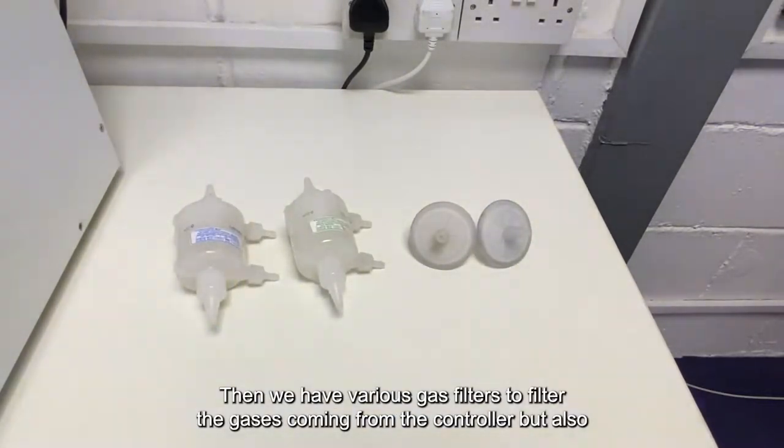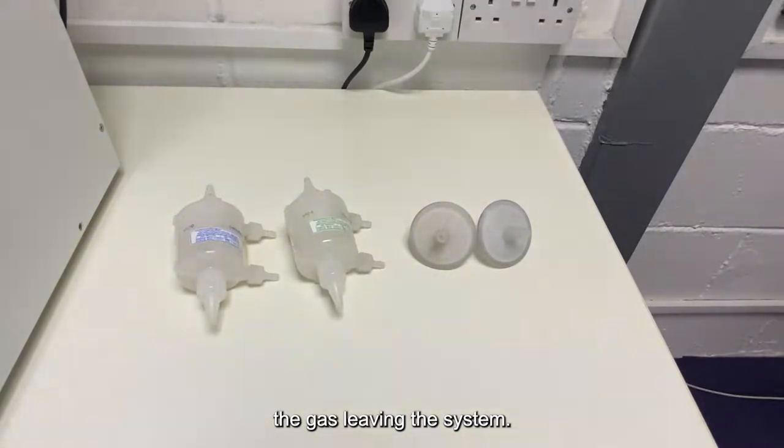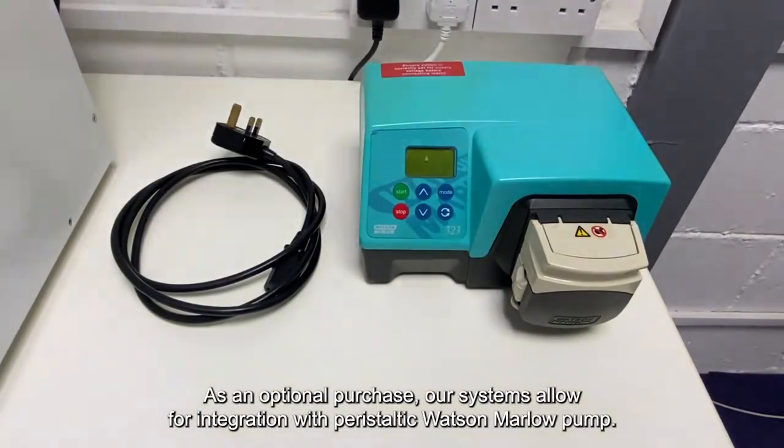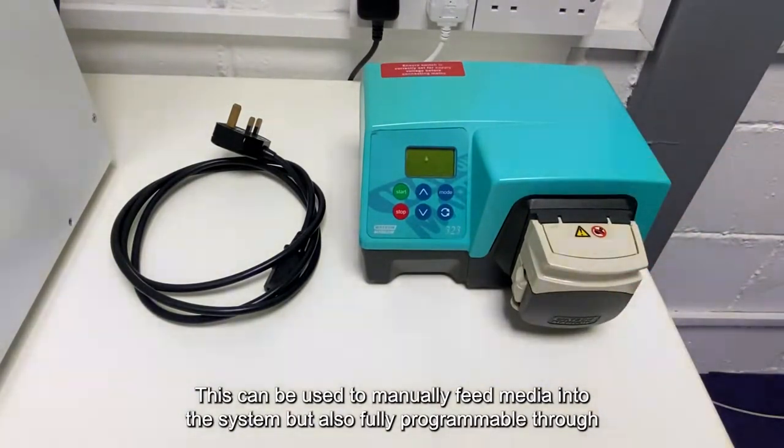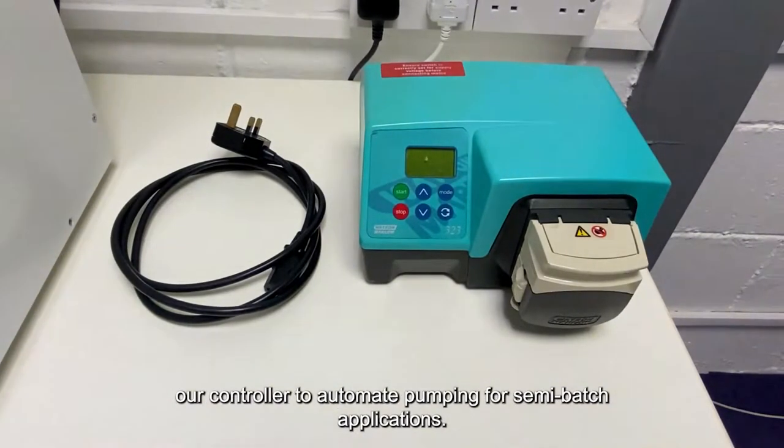Then we have various gas filters to filter the gases coming from the controller, but also the gas leaving the system. As an optional purchase, our systems allow for integration with the peristaltic Watson Marlowe pump. This can be used to manually feed media into the system, but also fully programmable through our controller to automate pumping for semi-batch applications.